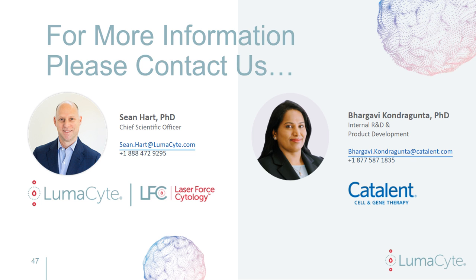All right. Bhargavi, are you also planning to look at real-time AAV infectivity measurements? Yes, I mean, that would be the next main area that we would like to use this Radiance for once the method becomes available. So currently a method is being developed at LumaCyte that we're looking to evaluate.